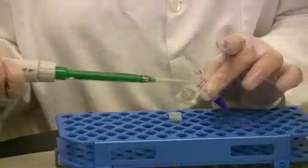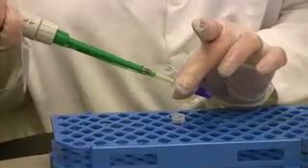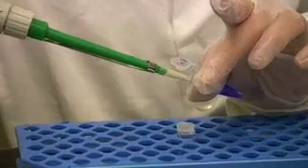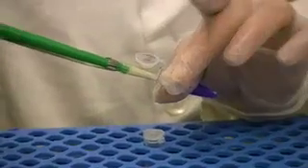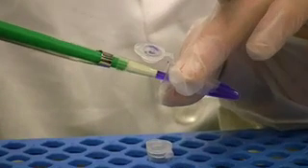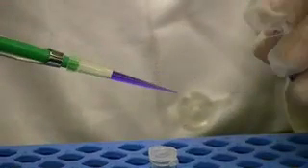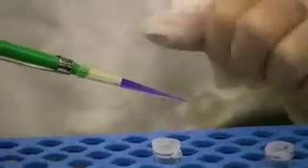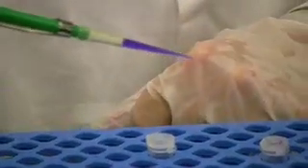I want to put the pipette tip slightly under the surface of the crystal violet and slowly withdraw my sample by releasing the plunger. You do not want to release the plunger quickly, because that could introduce air bubbles into your sample or contaminate the shaft of the micropipetter.